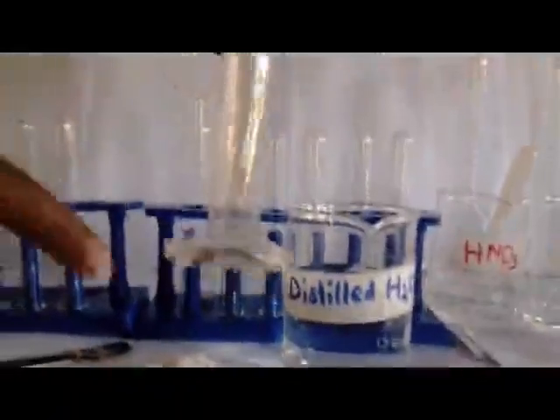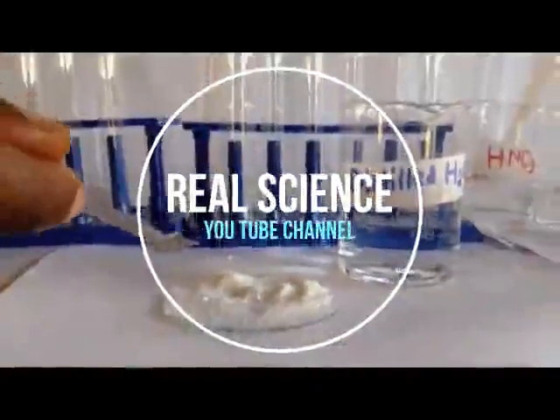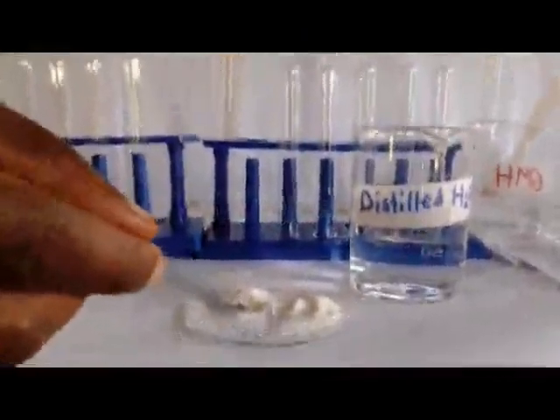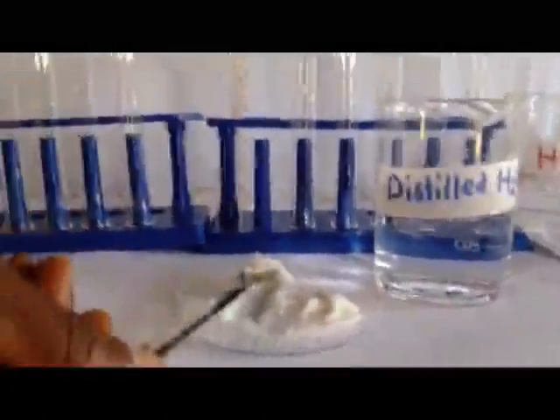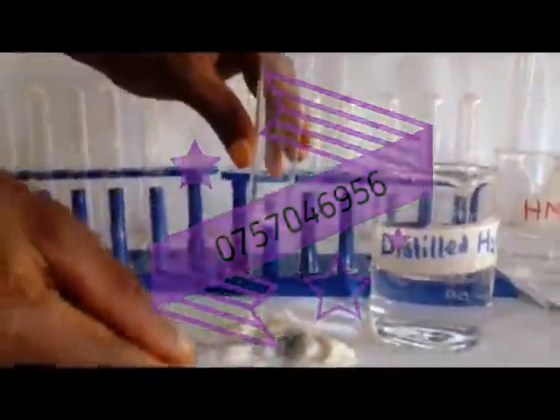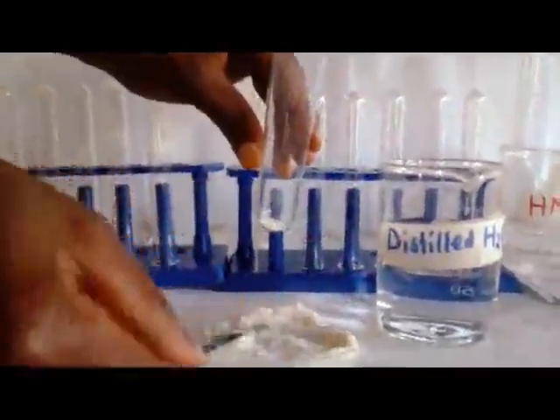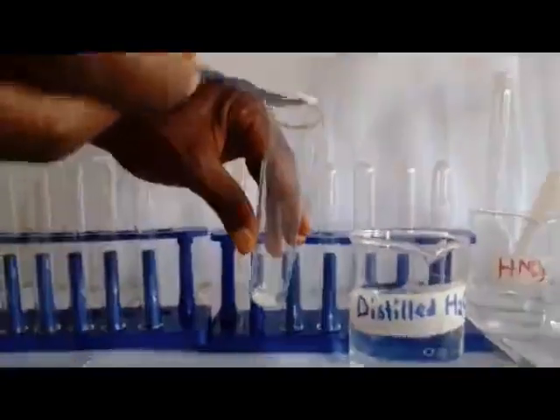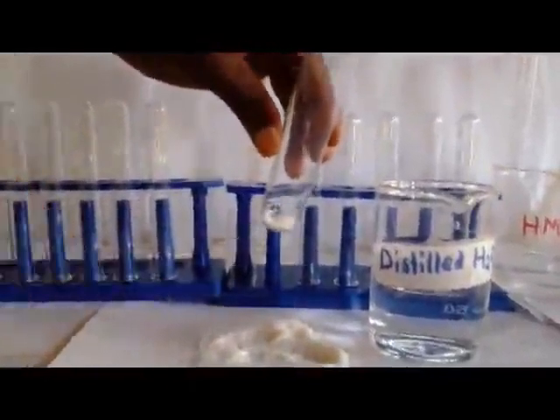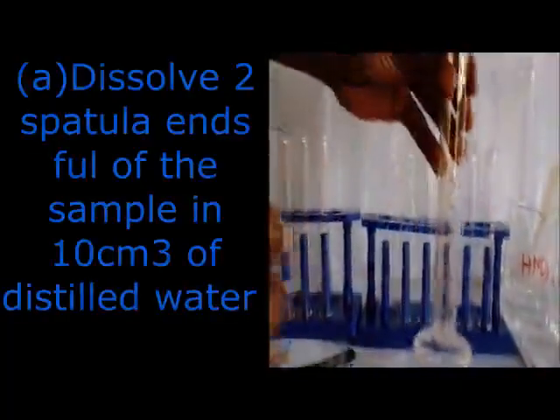Then members, from there we can go to the point of dissolving in water. When you are dissolving in water, you make sure you measure properly the amount of water, as the question is saying, or as the teacher has told you. When we are measuring our water, we use a measuring cylinder. Then you get a clean boiling tube or test tube and dissolve your salt there. As you are dissolving your salt, you shake properly, such that the crystals or powder try to dissolve. Here you are going to discover whether the salt is dissolving or not dissolving.